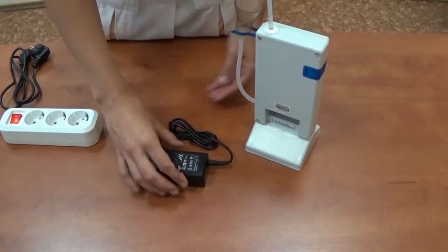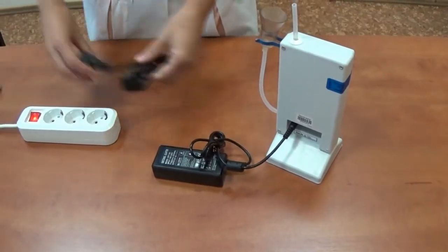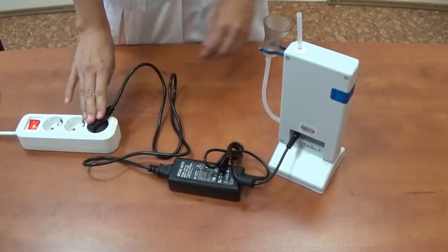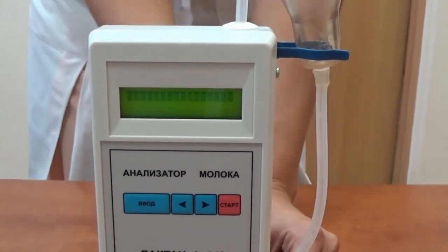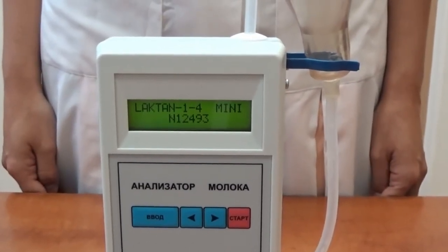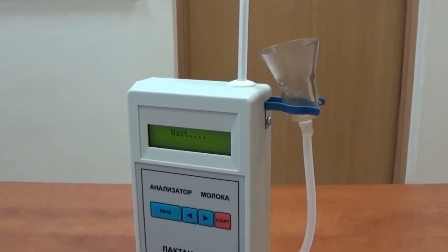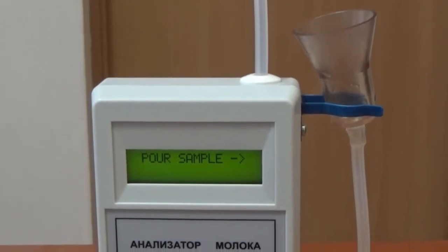Before starting work it is necessary to read the user's manual. Place the analyzer on the working surface and connect it to the power supply unit. Connect the power cord to the 220-volt supply line or to the car cigarette lighter at 12 volts. After the sound signal, the following messages will appear on the display: Lactan Mini, the software version, and the analyzer's serial number. After that, the analyzer will turn on warm-up mode and the screen will display a wait message until warming up is completed.